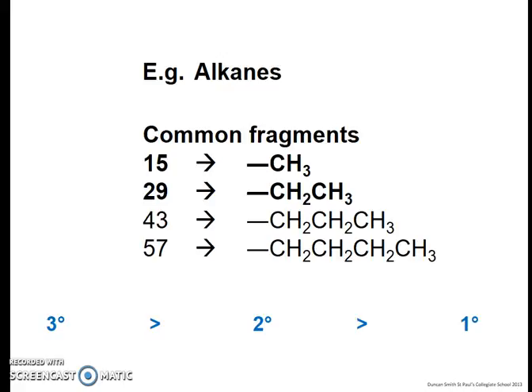Now, the other thing to note is that tertiary fragments, so that's where you've got a carbon that's attached to 3 other carbons, that group will tend to stay together. It won't fragment up very easily, but it will break off quite easily. So you'll quite often see a tertiary fragment or a secondary fragment existing on its own, because they tend to put more strain on the molecule, so they tend to split off a bit easily. Okay.